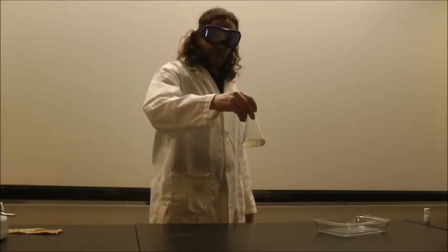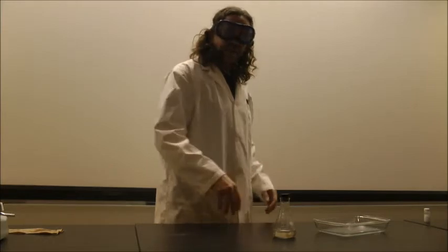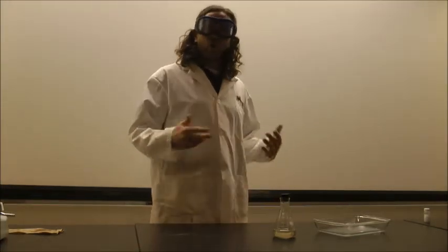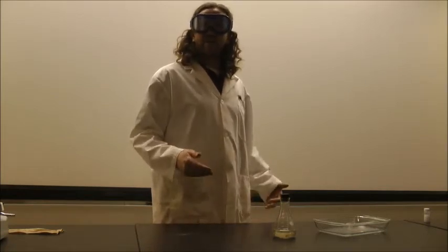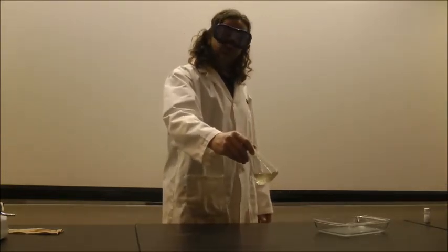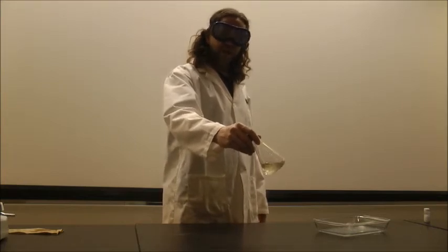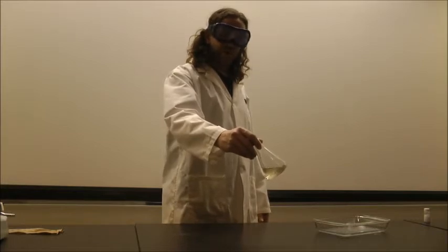A solution is a mixture of two substances that evenly distributes those two substances throughout so that you can no longer tell the difference between them. So for example, if you had some salt water, right, that is a solution. So what I have here is similar to that. So this is a solution of sodium acetate in water, or you might say it's a solution of water in sodium acetate.